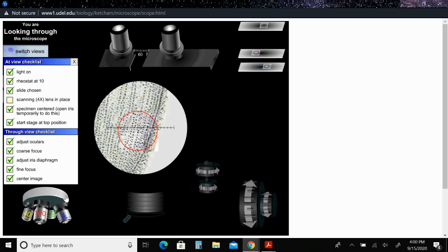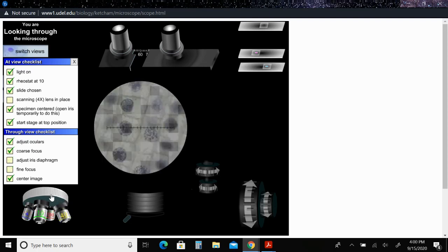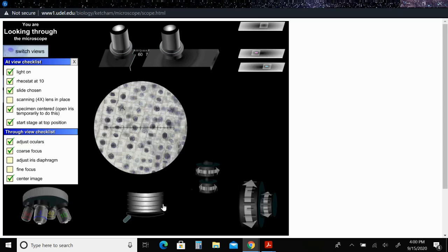Okay. We're going to go again. Oop, too far. There we go. Okay, adjust our lighting. And then our fine focus.